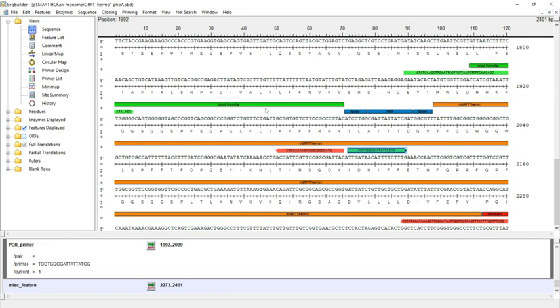You can also forego that, and depending on what you have and what you do, you can actually delete sequences between those primers. So in this area right here, if your primers were spaced further apart, for instance, you could delete those entire regions of DNA and basically cut and paste. Essentially, PCR in this way will allow you to cut and paste certain things in and make completely different DNA, or rather modifications of your existing DNA.